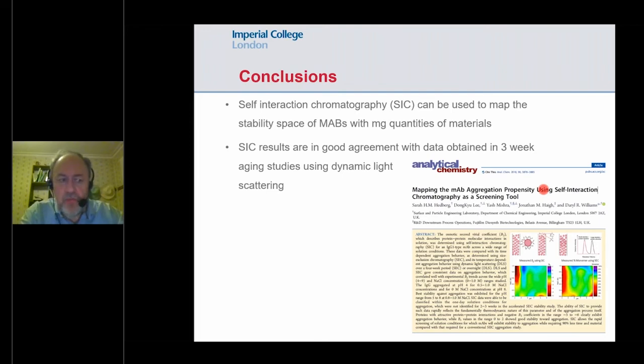It's a good question. It's difficult to be exactly certain whether the peptides, or in fact whatever you've immobilized, have the same sort of conformations. We're doing a project at the moment where we're trying to get a better understanding of different immobilization methods. If I immobilize, in this case peptides, 2 or 3 different ways, do I get the same result? But the conformation of the particle in the immobilized stationary phase is difficult to be certain how well that mimics, if you wish, the conformations in the actual mobile phase. I don't think we've got a clear answer to it at the moment.